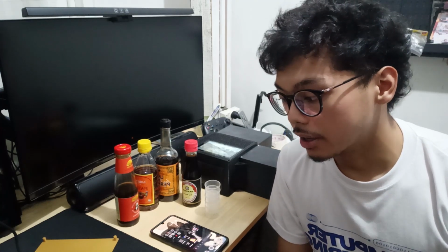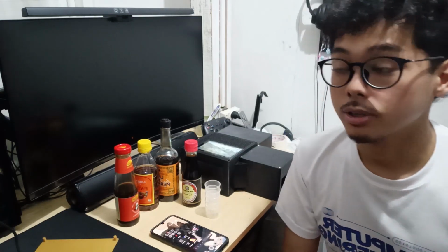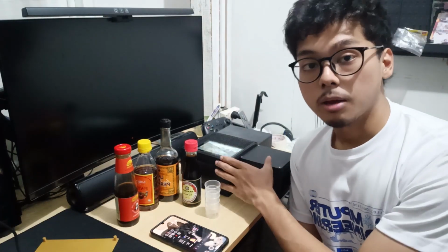Good day to everyone. Today is March 1, 2026, and I'm going to be recording this video of our prototype demonstration for our thesis entitled Classification of Dark Condiment Sauces Through Electronic Nose Using Support Vector Machine. So, this is our prototype.